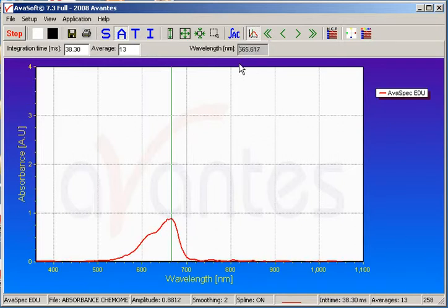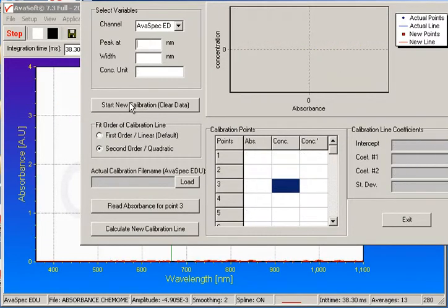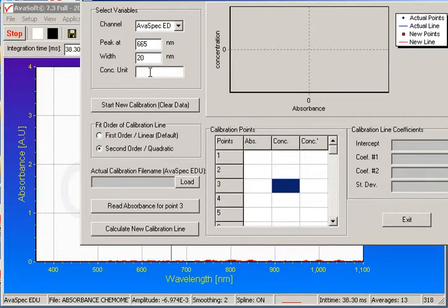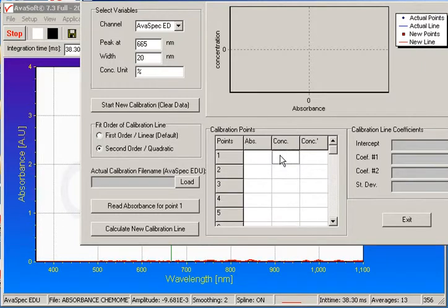Using that information, we will create our calibration line. We remove the sample, place the solvent back into the cell holder, and go to Application, Chemometry, Settings. We clear out data from the previous experiment and set the peak at 665 nanometers. We set the peak width to 20 nanometers for this demonstration, though 40 or larger could also be used depending on peak width. For the concentration unit we will use percent, though moles is also an option. We can select either a first order or second order quadratic fit; with several samples, a second order quadratic fit should provide a better fit for this calibration.